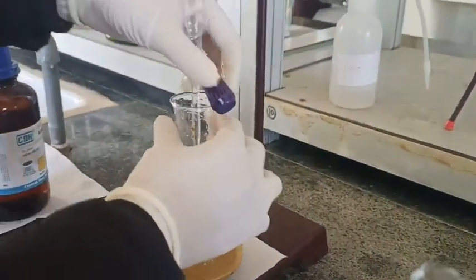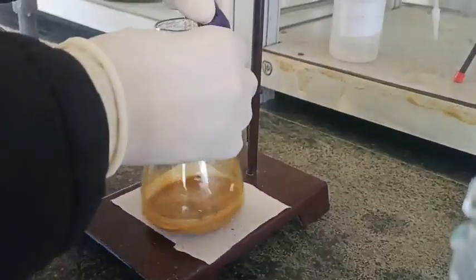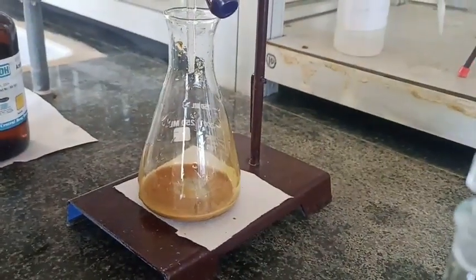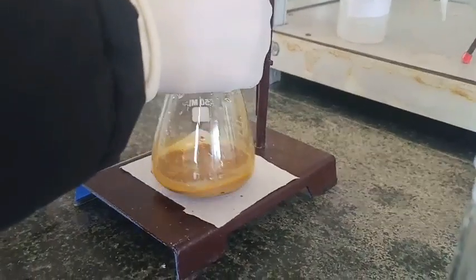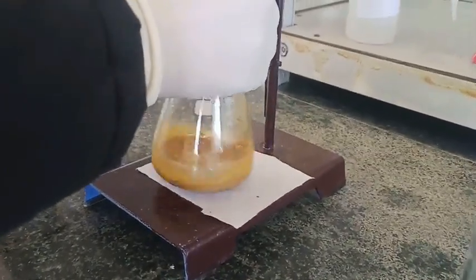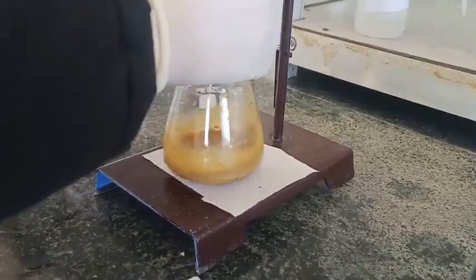So I'll take the initial reading, which is 0. When this color is getting faded, at that moment I am going to add the starch.